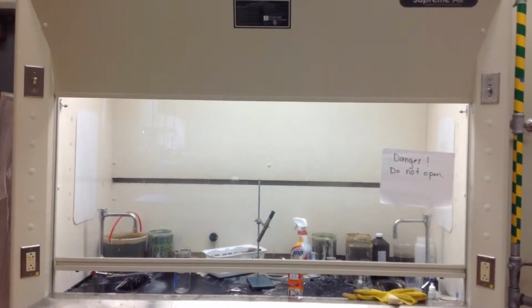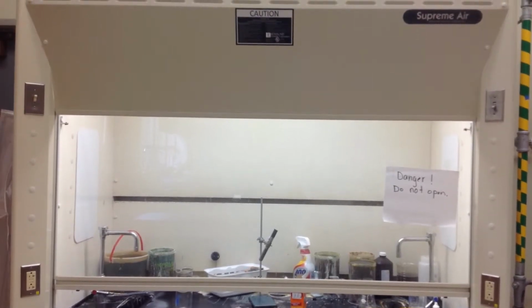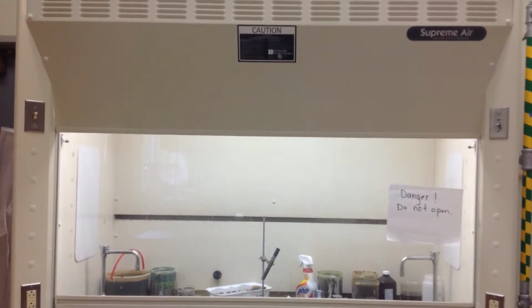This experiment should be done with caution due to the use of hydrochloric acid and the formation of toxic gases. Because of this, I will be performing the experiment in the fume hood.